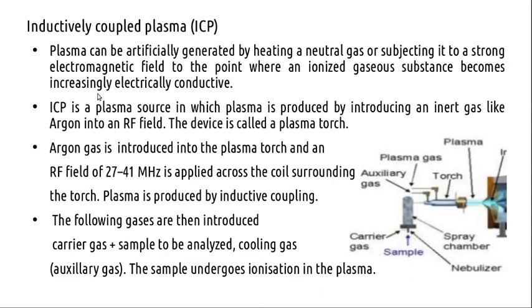Then, ICP-MS is a very widely used technique. I have included a video of a product, an ICP-MS by Shimadzu, in the classroom, so you can see that product in a brief video which describes how it works. Now this plasma torch is a mechanism which is used to generate the plasma in an ICP-MS system.